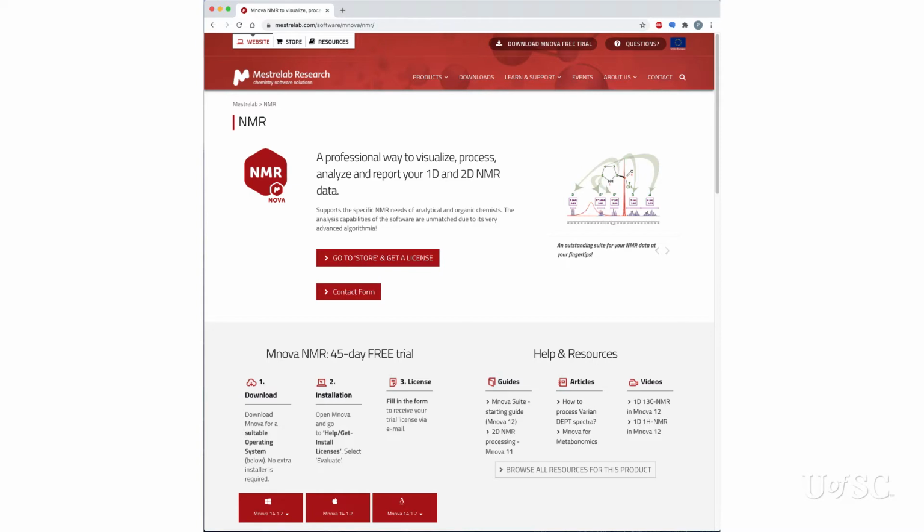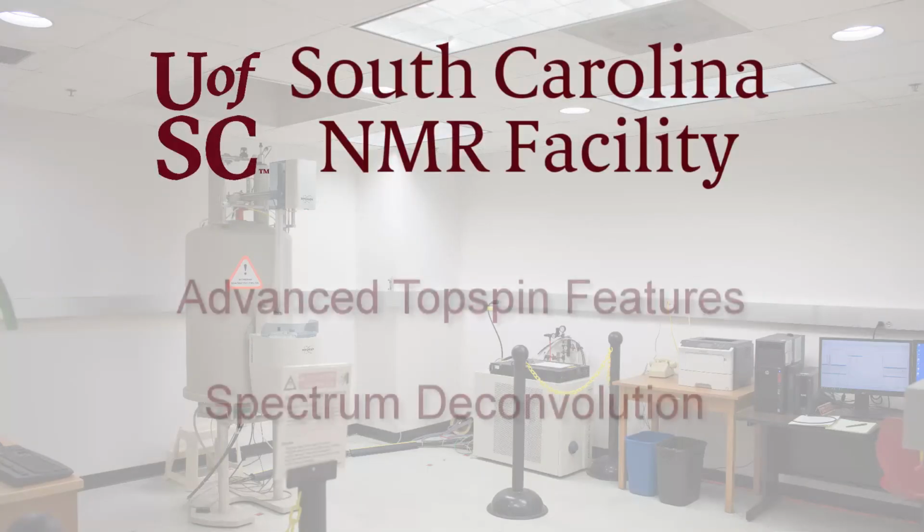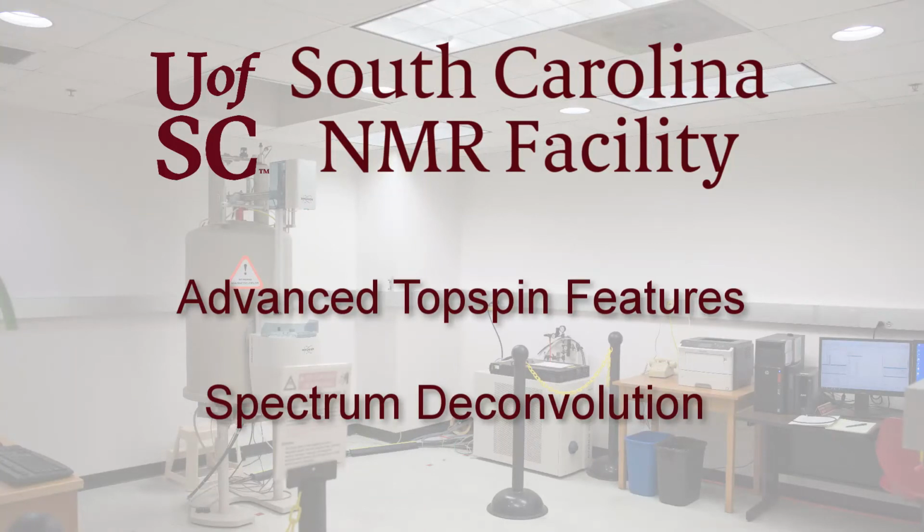However, MNOVA is not free and the cost might be prohibitive for some research groups. Mestrelab allows downloading a demo version so you can test the program for your project before you commit to purchase. Please see the staff for assistance with using the deconvolution routine in Topspin or if you have any questions about MNOVA's capabilities.